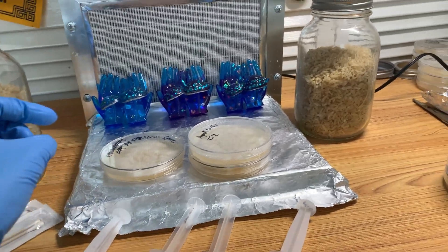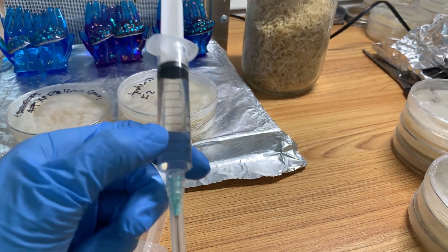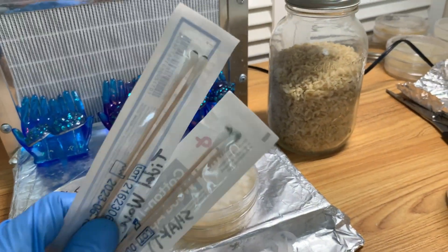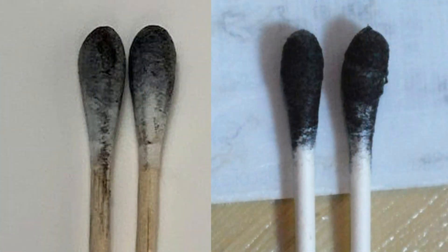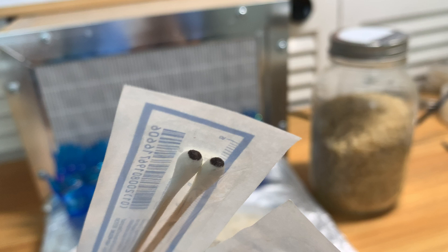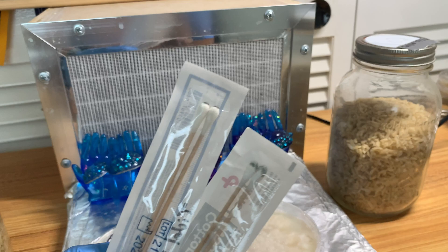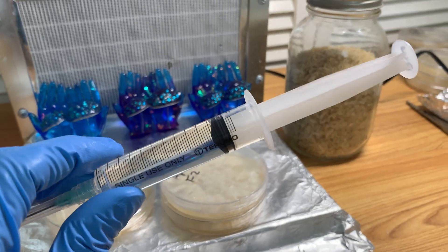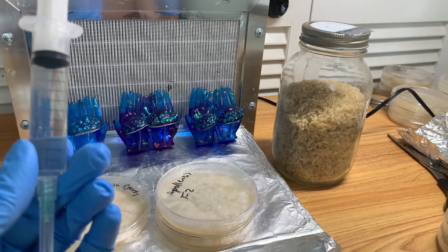Cleanliness is paramount — if your inoculant is dirty, even successful germination means you might have to dump the jar. Speed is basically a bonus. And as I said, contamination does play a role if you use too much — it's completely unnecessary and just increases your contamination risk. So here are the key takeaways: a swab completely covered with discoloration is not necessarily better than a more concentrated or partial swab. Freshness matters most, and too many spores increases potential contaminants piggybacking into your syringe.